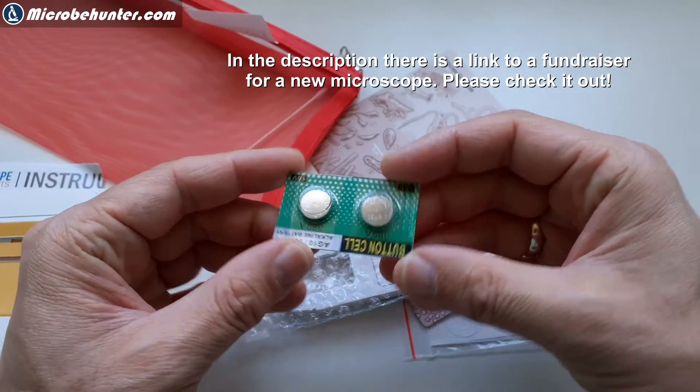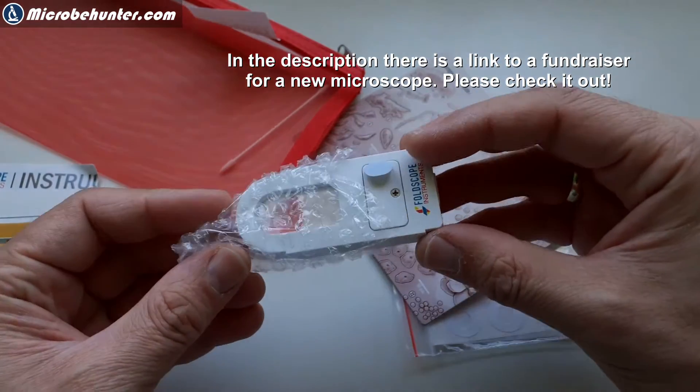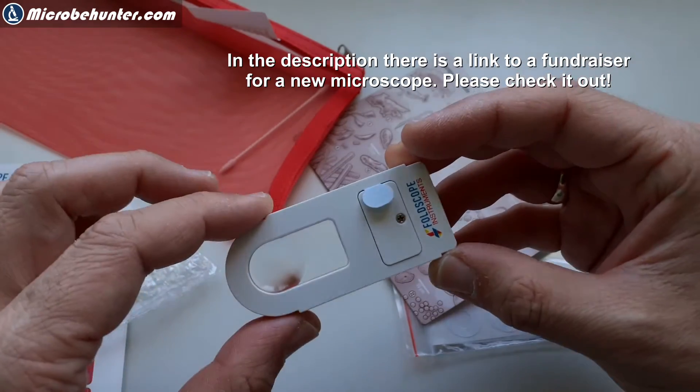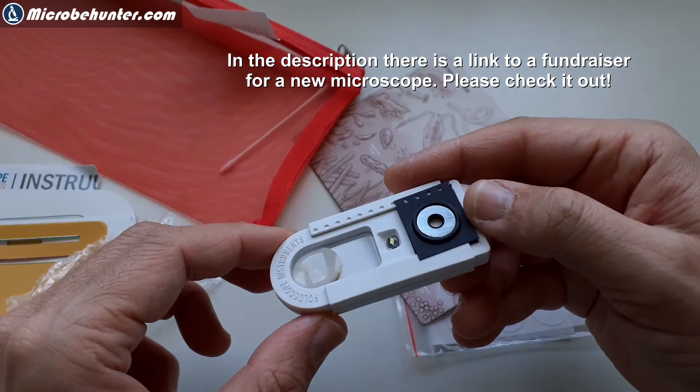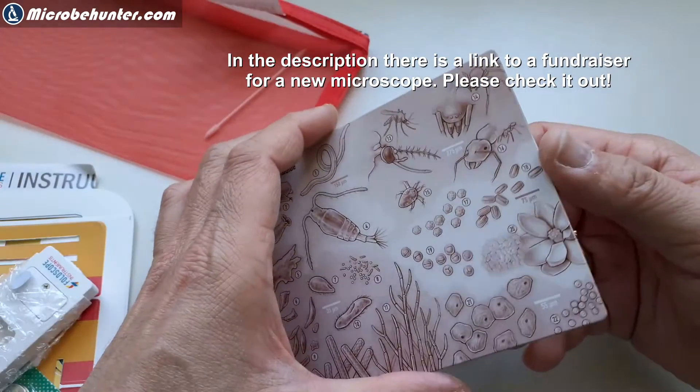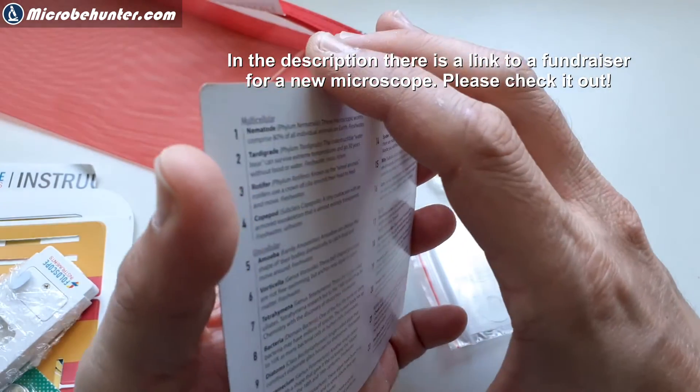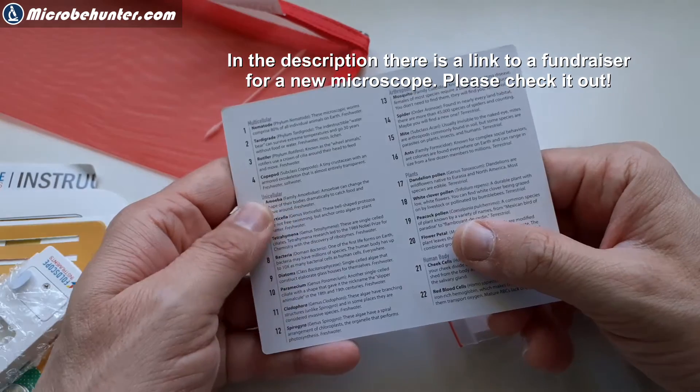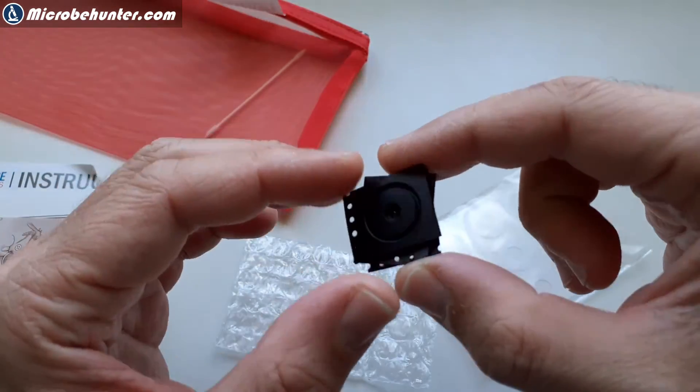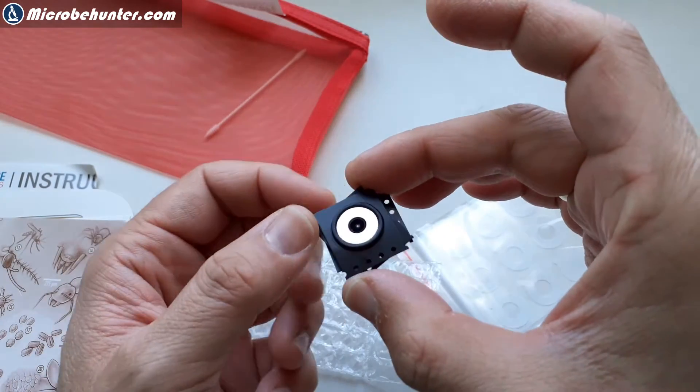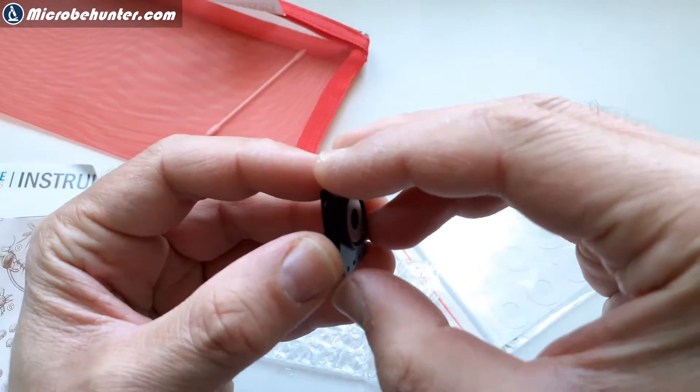And that's the Foldscope itself and there are a whole bunch of other accessories. Batteries. I first wondered why do I need batteries for the Foldscope. But then I discovered that there was a little magnifying glass included with an included LED, which already contained batteries, by the way. And this one can be attached also as a light source for projecting the image. First, I thought this was some kind of a CD, but actually it's not. It's some kind of a reference card with drawings and a description of water life. I wondered what this is and it was magnetic, but there were several of them and these are couplers.